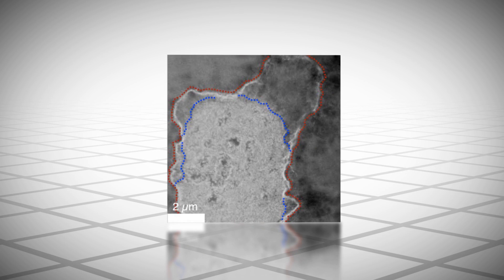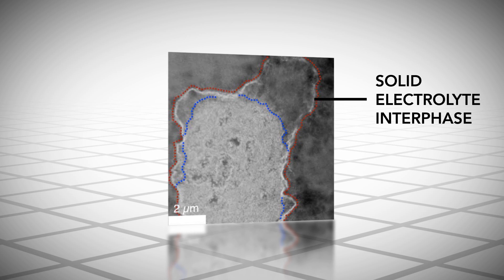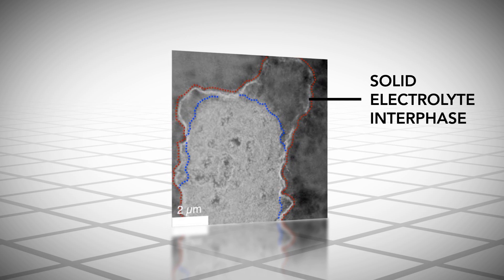But the coup de grace came from something called the solid electrolyte interface. This layer forms around the electrode and blocks the battery from taking a charge.